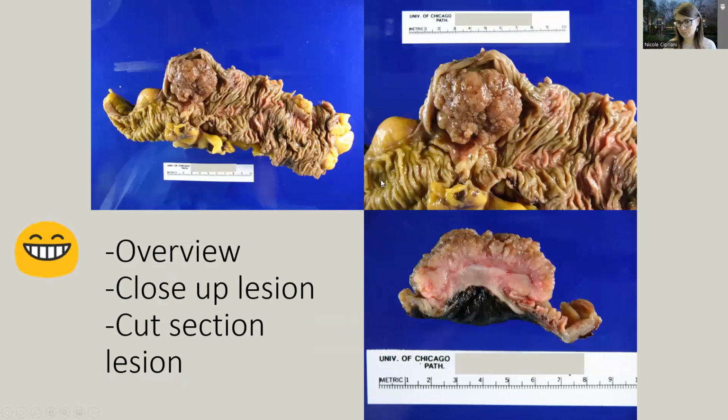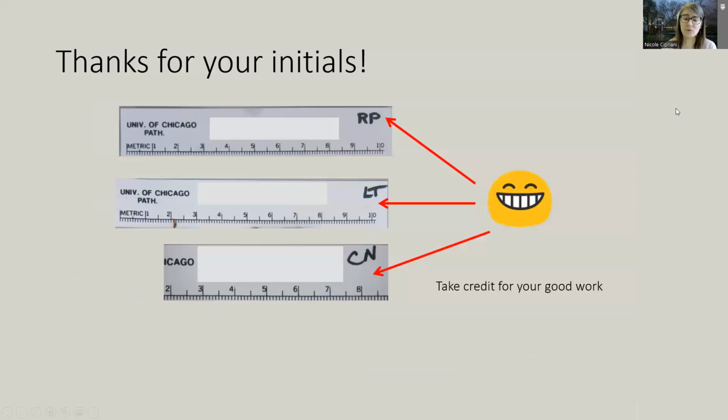So that was great. In this case, again, of a tubular gut specimen, we have the gut opened up where you can see the tumor in the lumen. We have a little bit of a closer up view of the tumor, bird's eye. And then boom, we have a nice cross section of the lesion where you can see how it's puckering up the mucosa and the muscularis, etc. So this was sort of a nice landscape of that tumor.